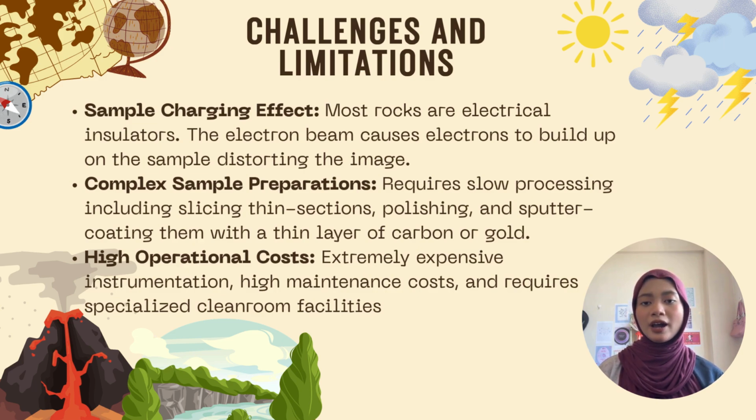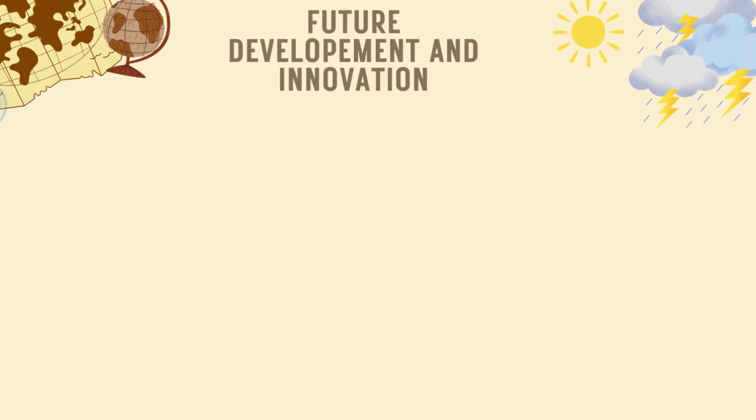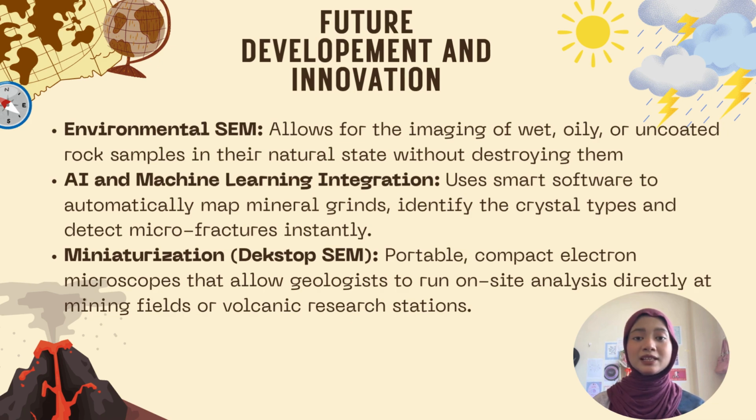Lastly, there are high operational costs. These are extremely expensive instruments with high ongoing maintenance fees. Furthermore, they require highly specialized clean room facilities to isolate them from vibration and magnetic interference. So, to overcome these exact limitations, the field of microscopy is evolving rapidly. Let's look at the future innovations transforming Earth science.